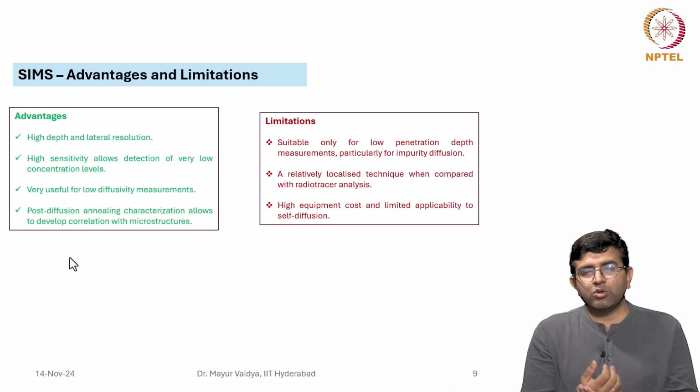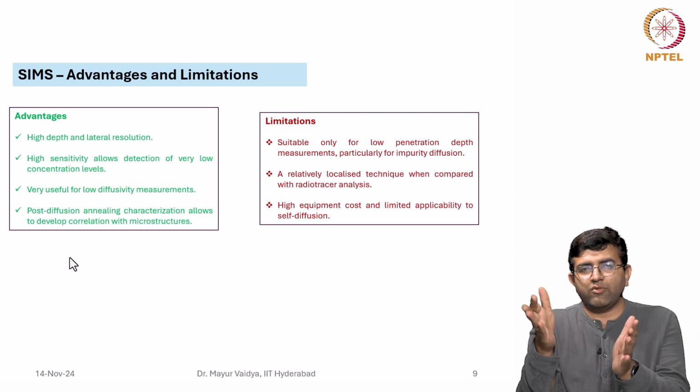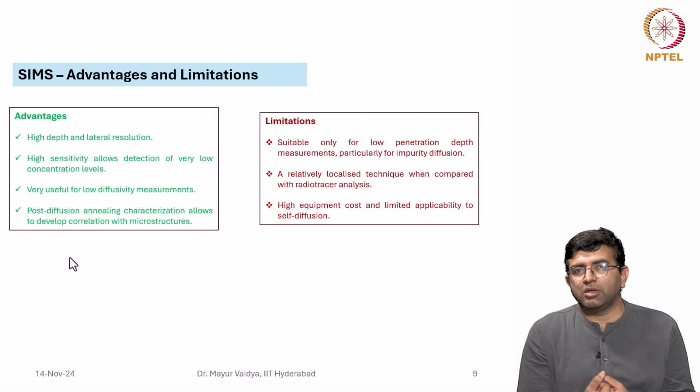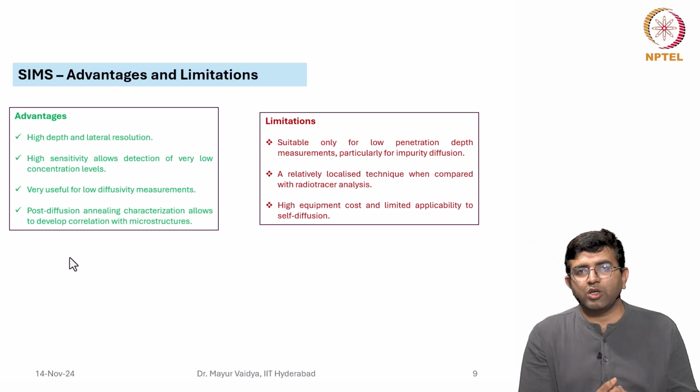You can also read about other detectors. Because this is a diffusion related course, I have only talked about the TOF detectors, but there are other detectors that can also be attached to SIMS, which are used for different types of applications. Typically, you will see that SIMS also finds a lot of usage in geology, in analysis of minerals and so on. So, you can read further on that if you are interested.